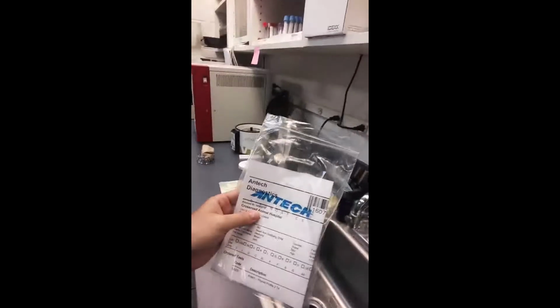Now that our timer has gone off, I'm going to use some tweezers to pull it out of the centrifuge. And then we'll place it in a labeled bag. I've already got the bag prepared. It's got the requisition in it. And we'll place the sample in the bag, making sure the name matches what's on the requisition. And then we're going to put it in the refrigerator until the lab comes to pick it up later this afternoon.